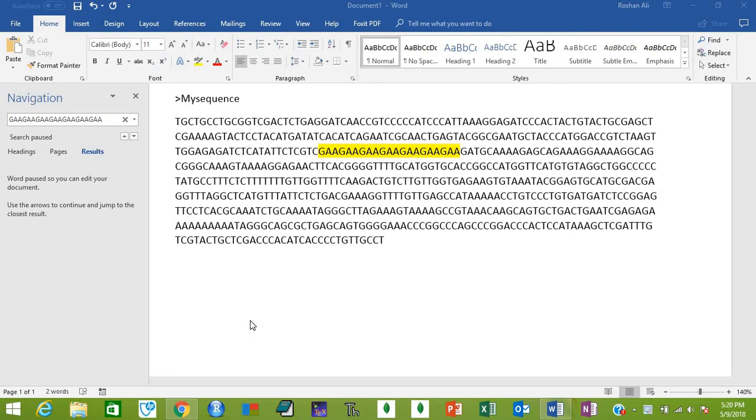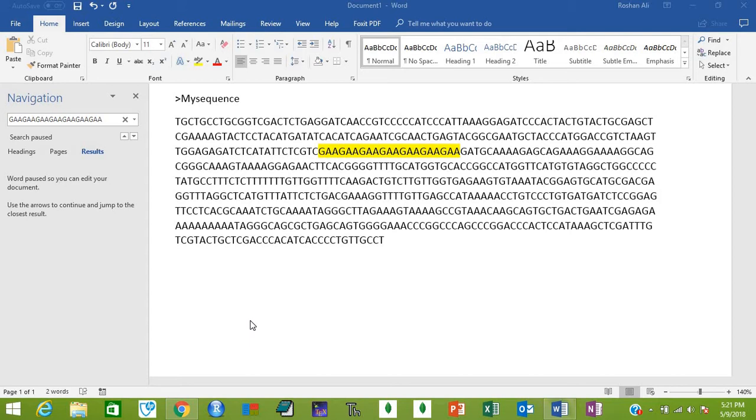That's why I'm making another video about SSR flanking primers. If you want to know what SSR flanking primers are, you must watch my previous video. In this video I'm going directly to the website to design the SSR flanking primers.